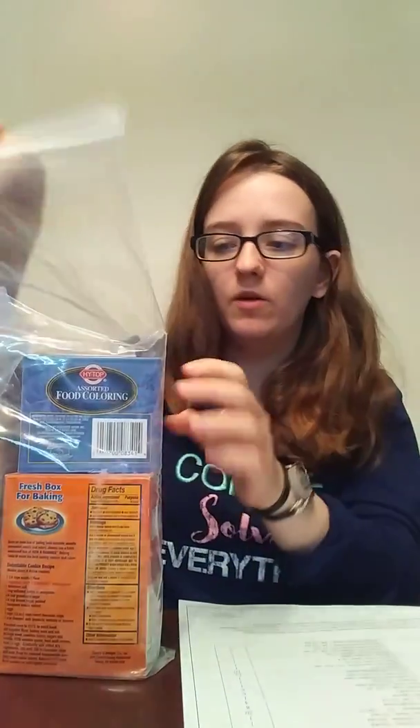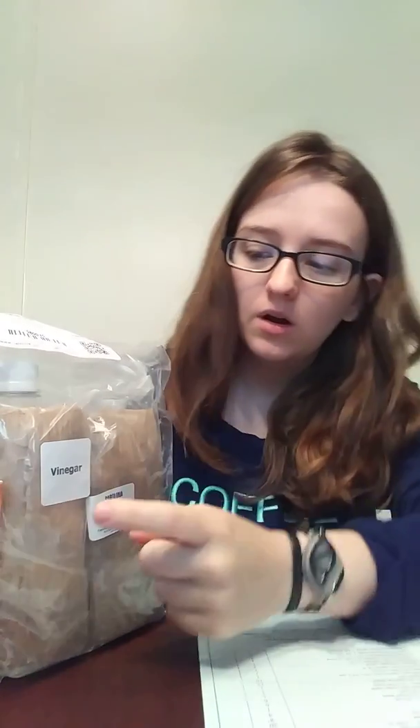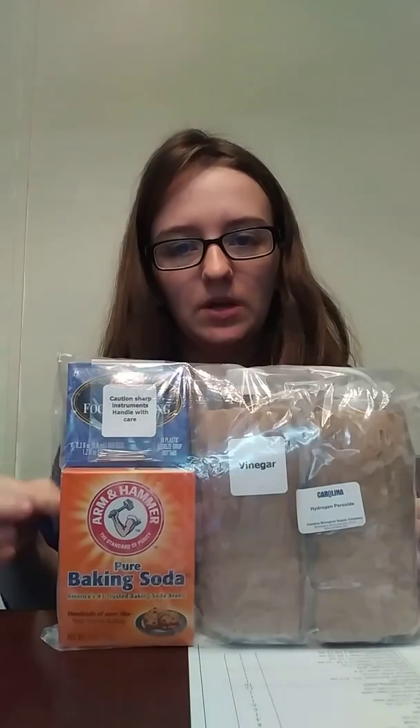This bag is chemical set one. I'm not going to pull this stuff out because it has baking soda in it, which during shipping has kind of busted open — it's kind of on everything. But in this one we have hydrogen peroxide, vinegar, baking soda, food coloring, and stir pens. This is a small chemical set, and I'm thinking it's going to be for the first experiment.